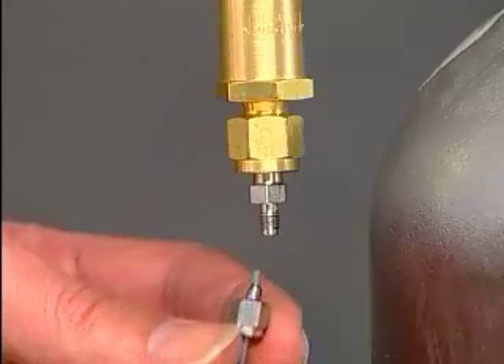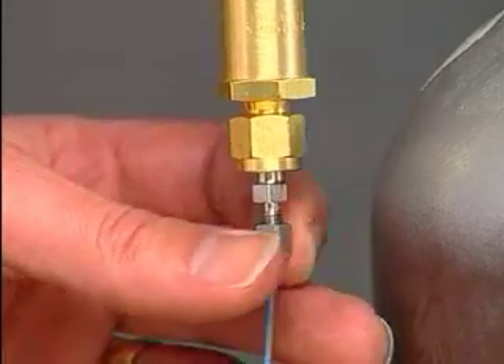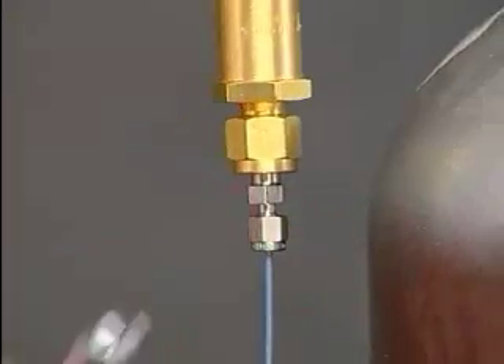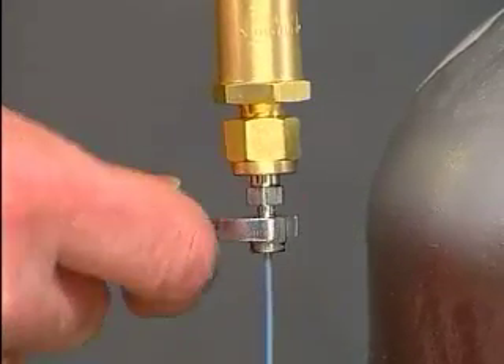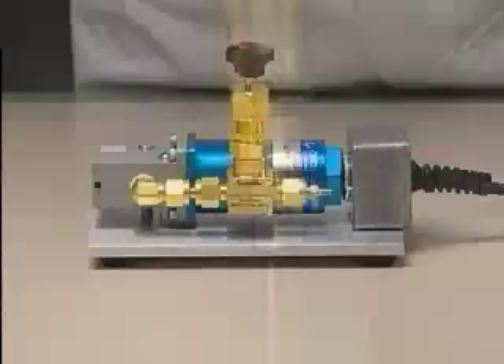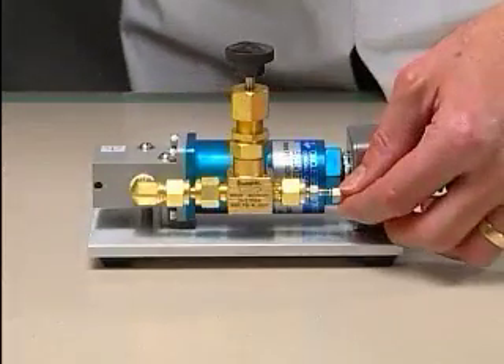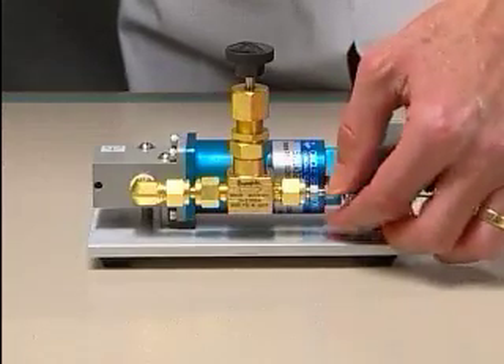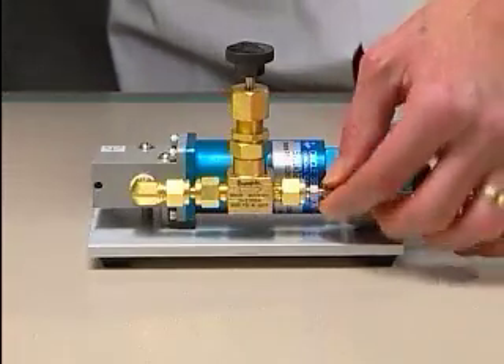Connect one end of the six-foot tubing to the helium pressure regulator and tighten the connection. Connect the other end to the inlet valve of the three-way helium valve assembly and tighten the connection.